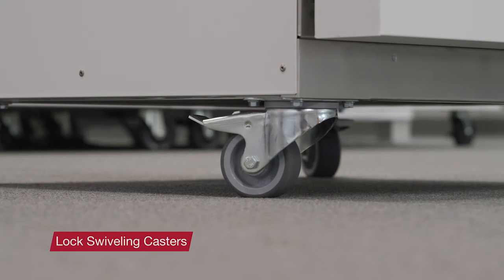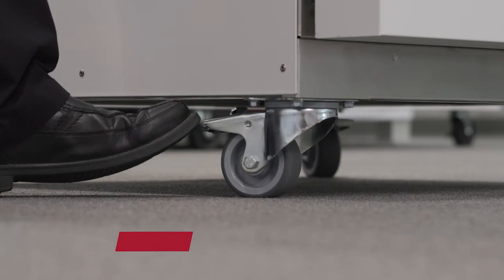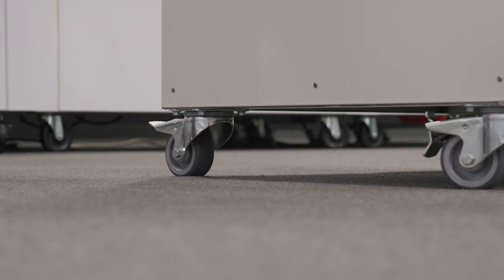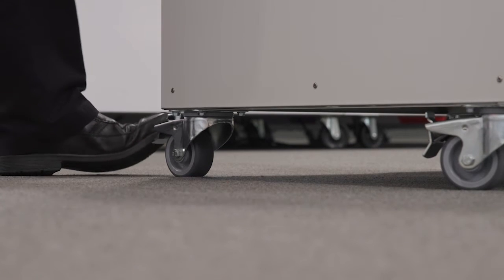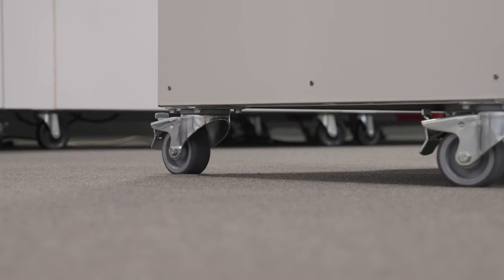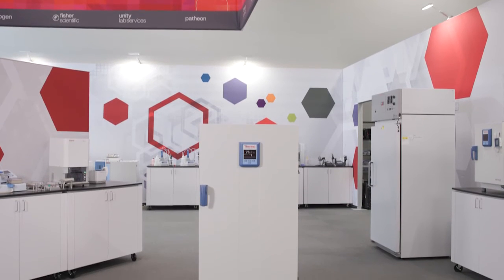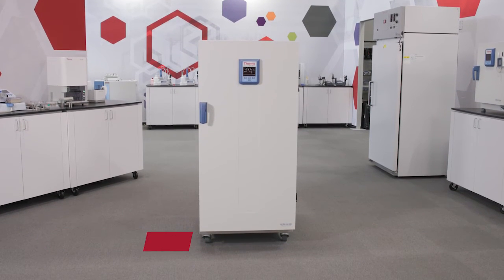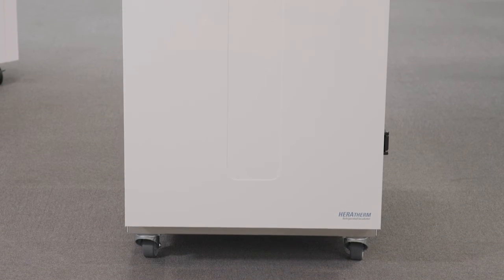Once the unit reaches its final position, lock the swiveling casters by depressing the lever brakes to stop the unit from rolling. If the brakes are not visible, carefully twist the casters 180 degrees until the brakes are visible at the front or side of the unit. When placing the unit in its final location, be sure to maintain the required clearance as listed in the manual to ensure proper ventilation.